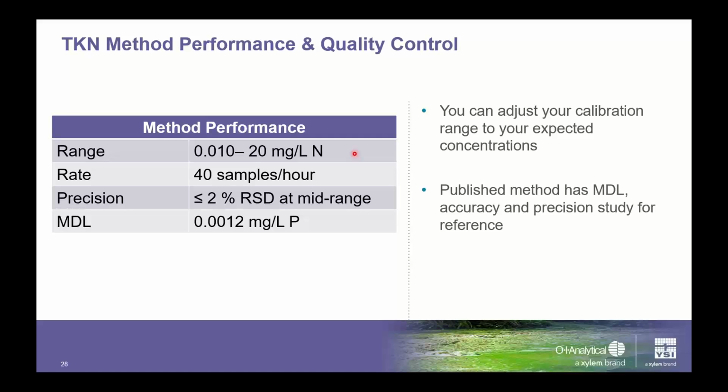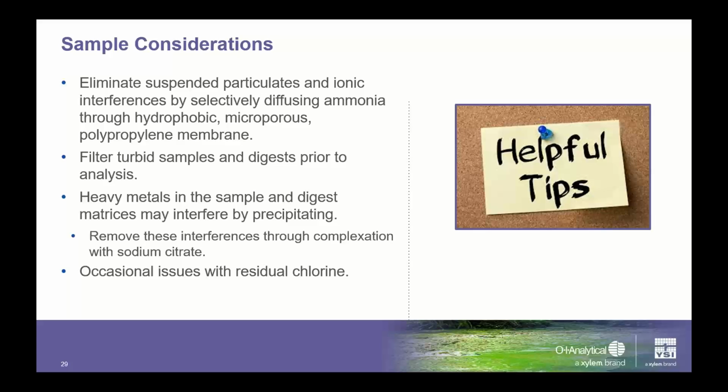Also, the sample rate can be increased, so you're cranking through by reducing the cycle duration in any of the methods that we make available to you.